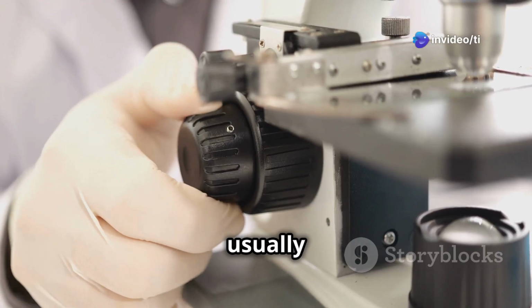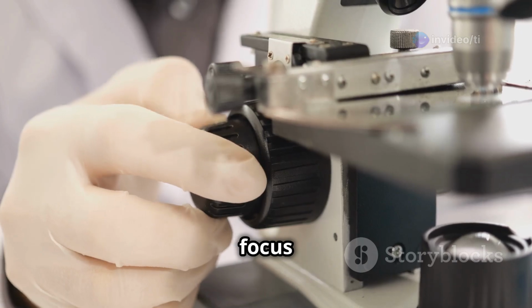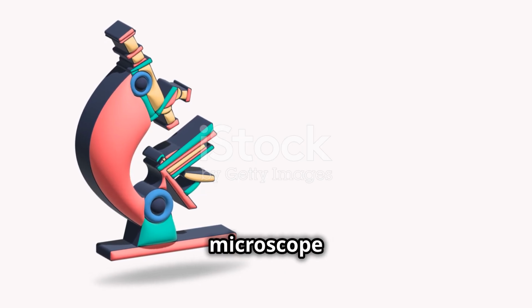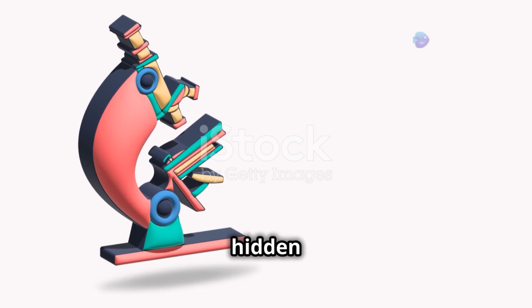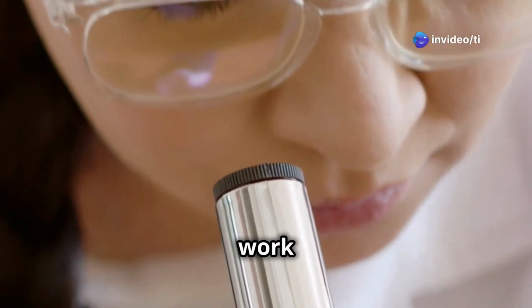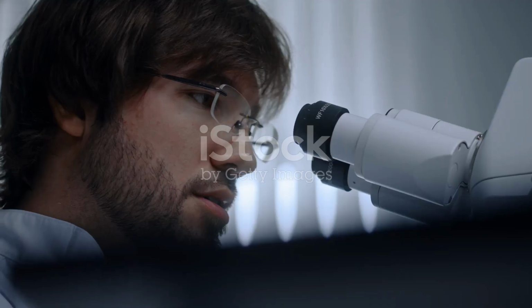Focus knobs, usually located on the arm of the microscope, allow you to adjust the focus and bring the image into sharp view. Each part of the binocular microscope plays a crucial role in revealing the hidden wonders of the microscopic world. By understanding how these parts work together, we can appreciate the ingenuity of this remarkable instrument.